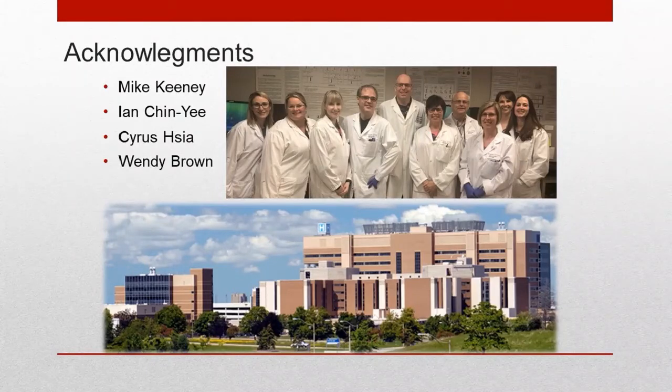Yeah, so because this is a Beckman Coulter project, sorry, not project. It was a project. The assay has only been run on a Beckman Coulter system, a 10-color system, either Navios or the Navios EX. There's no reason why it probably couldn't if there were the right filter configurations, but the advantage of this assay really is that it has been FDA cleared and is IVD.